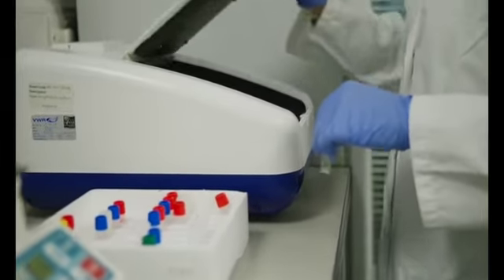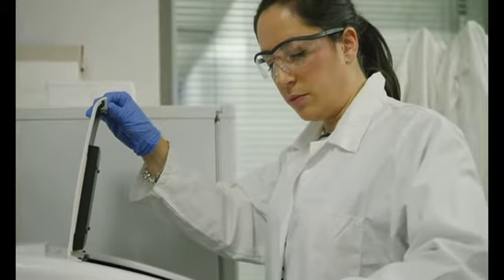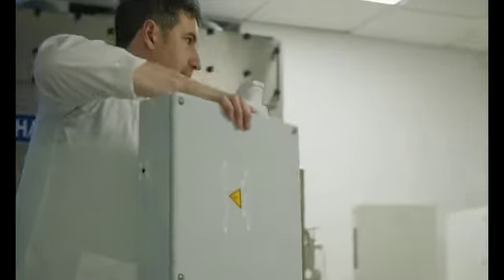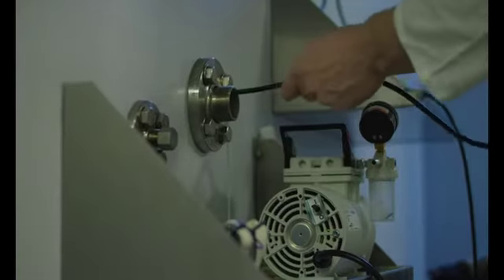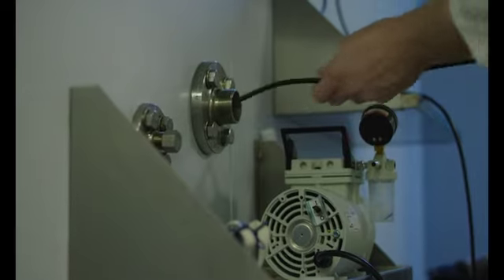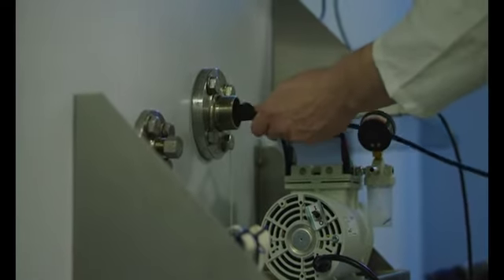The lab was designed after a lot of research on compliance laboratories and third-party laboratories across the world to see what equipment they use. We then took that information and designed a lab that was really suitable for the testing of air purification products.